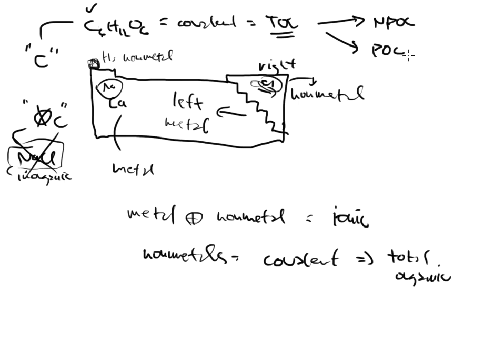I can put glucose out onto a countertop, and it's not table sugar, by the way, but I can put this glucose, which is a sugar, onto a countertop and sit there and look at it. Nothing's ever going to happen to it. It's not going to evaporate in front of my eyes. It's not going to disappear. So it's not volatile. It doesn't have a really low boiling point. It's a solid. So this is not a purgeable compound.